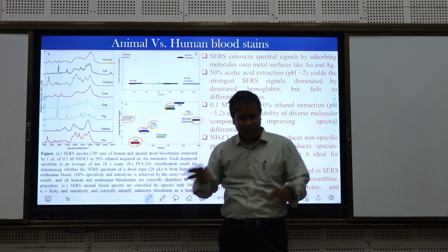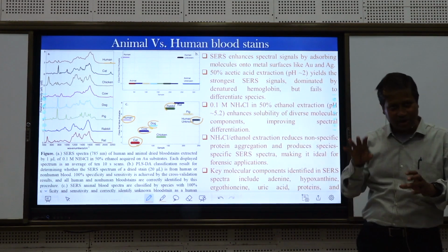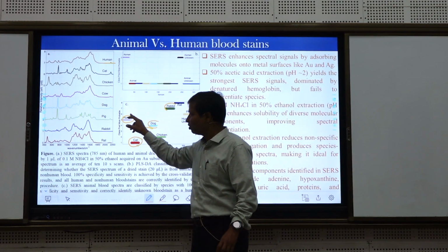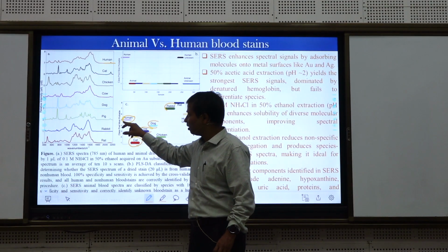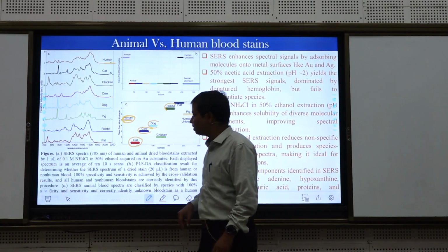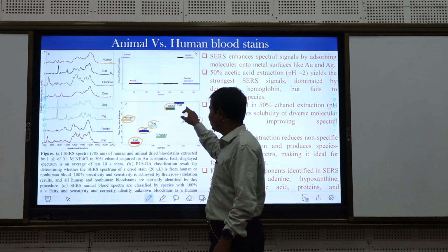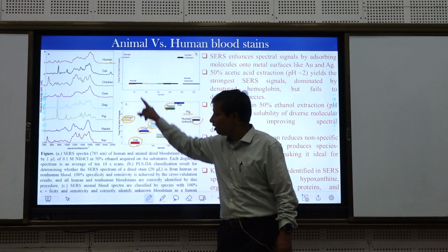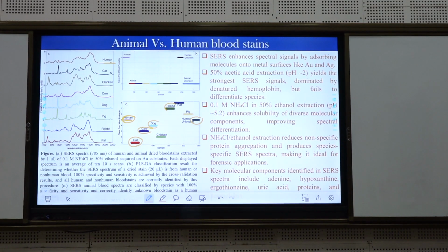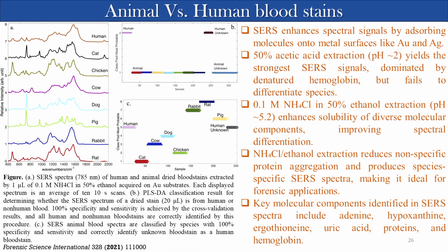So it's very interesting that based on Raman spectroscopy, if the blood comes to this region, this most probable class, then you have to tell this blood is from human, and everything is quite separated. So this technique is very nice to separate animal blood from human blood.